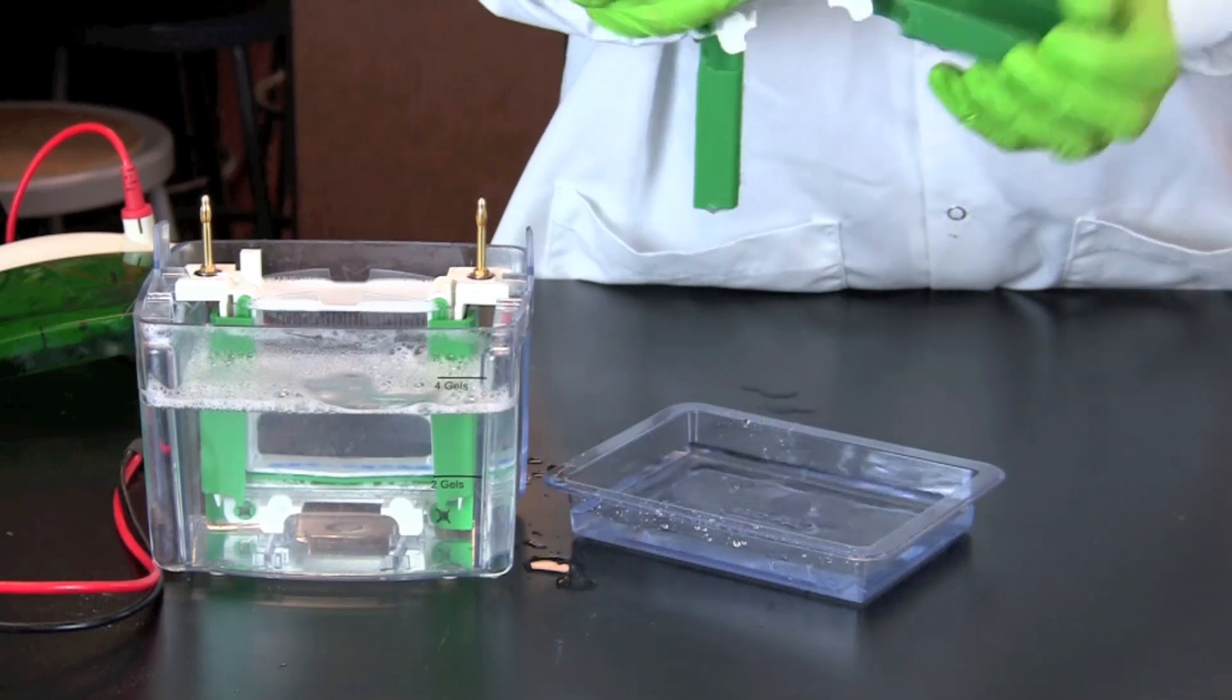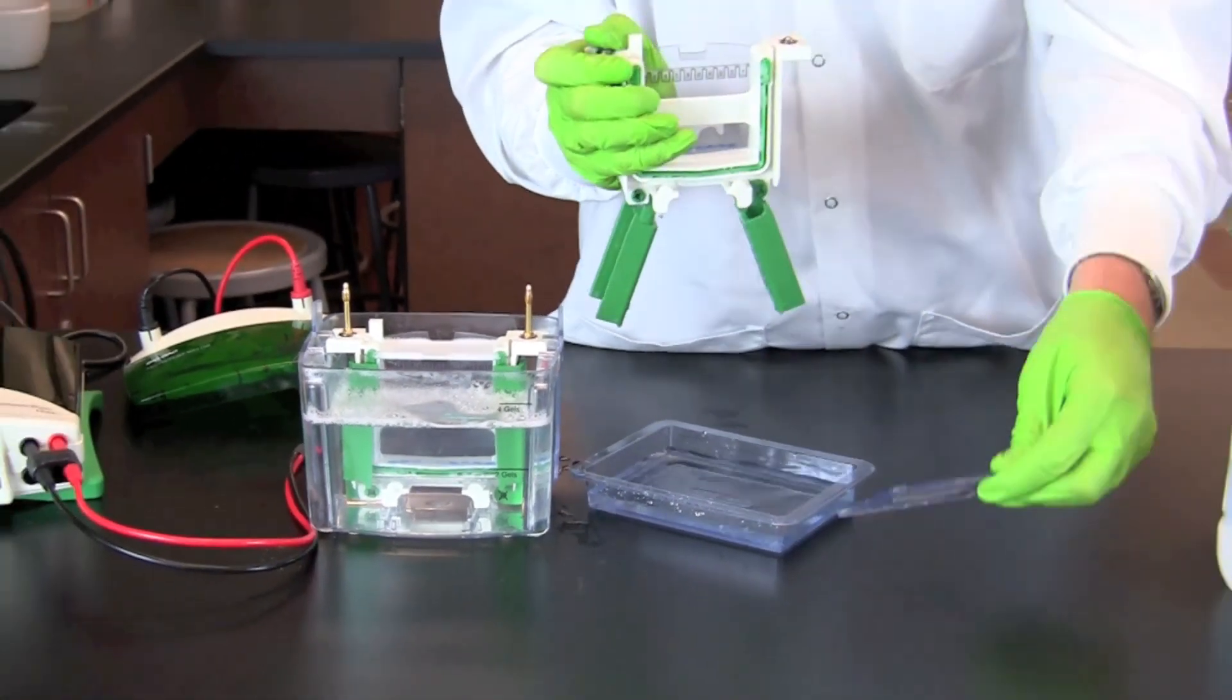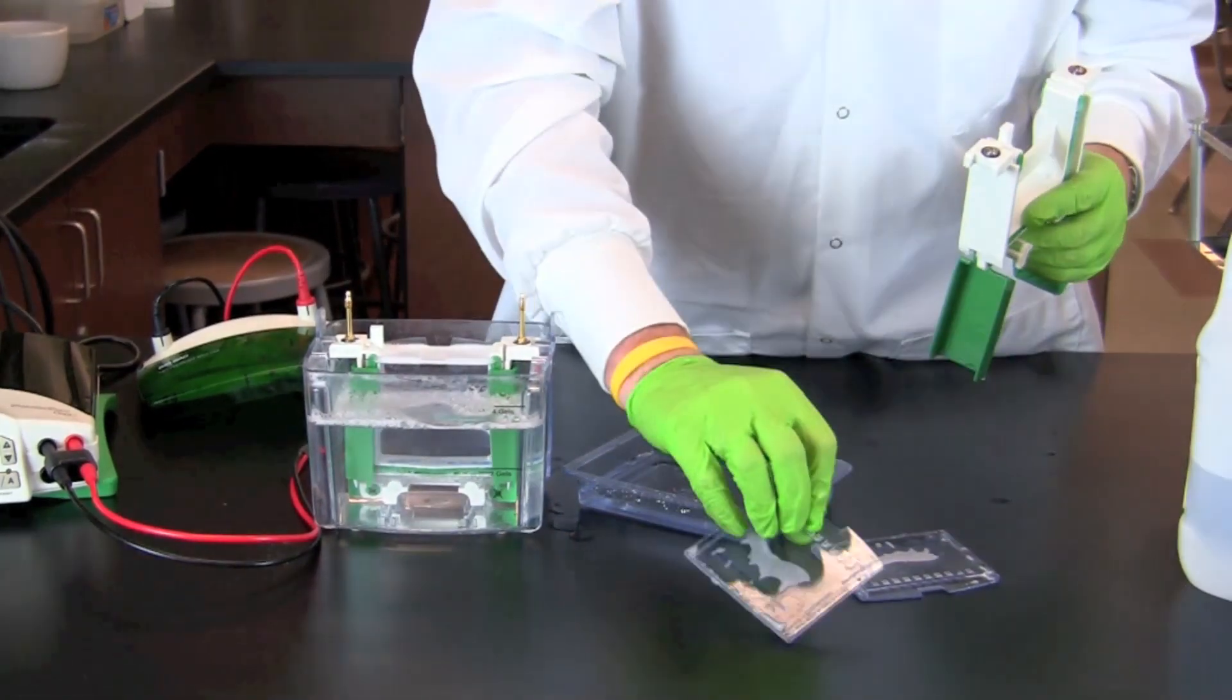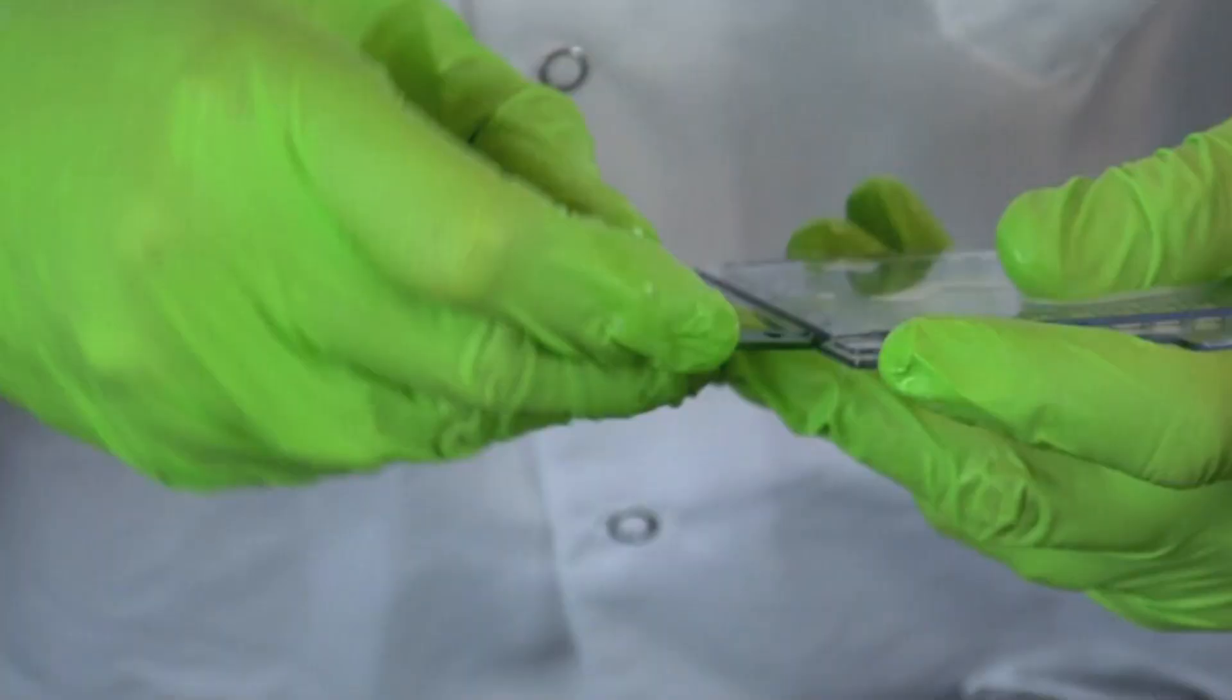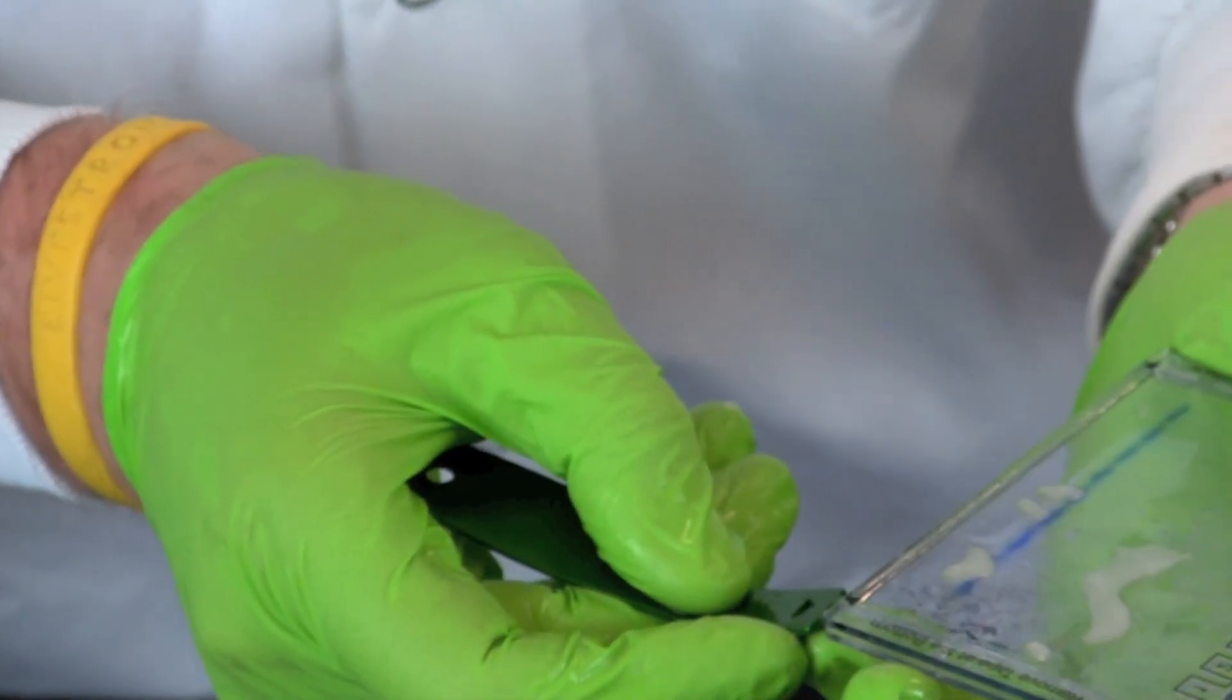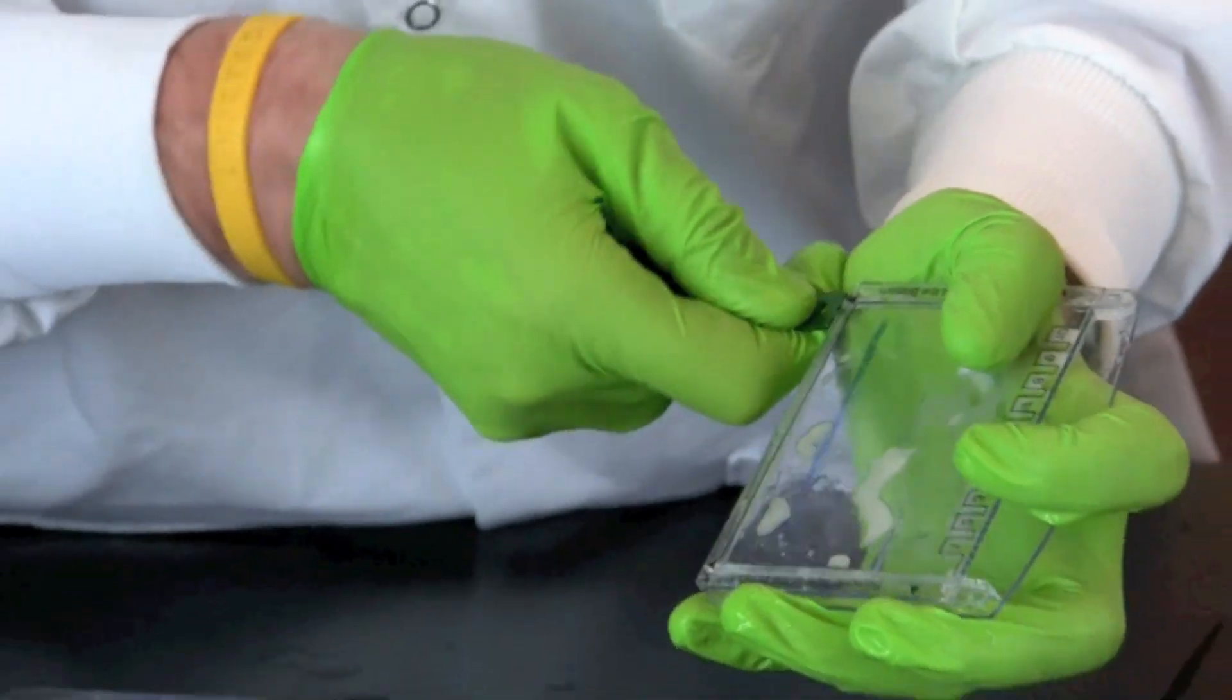Release the green clamps and remove the gel cassette from the electrode assembly. Remove the gel from the gel cassette using the opening key. Line up the arrows on the opening key with the four arrows on the cassette to open the cassette.